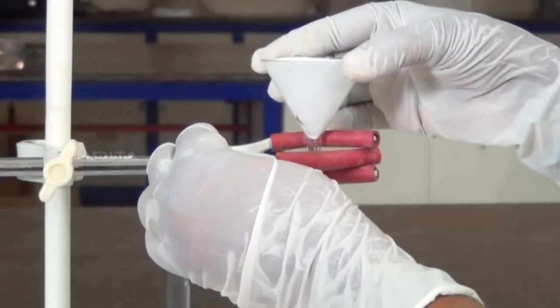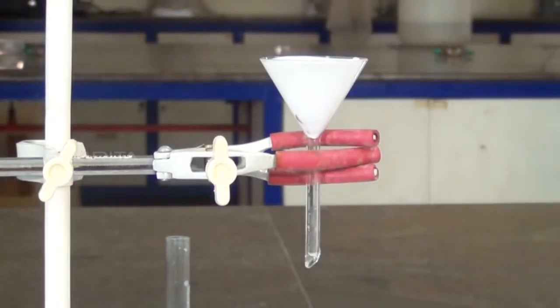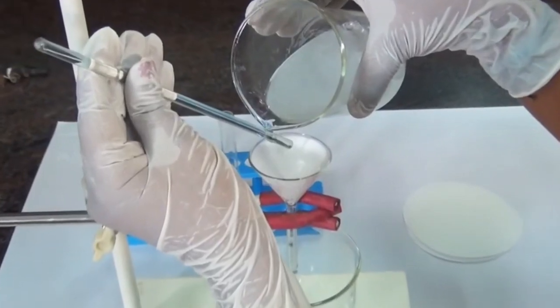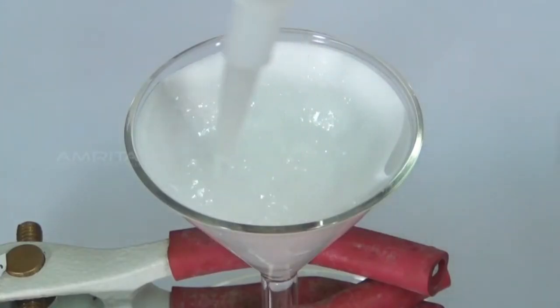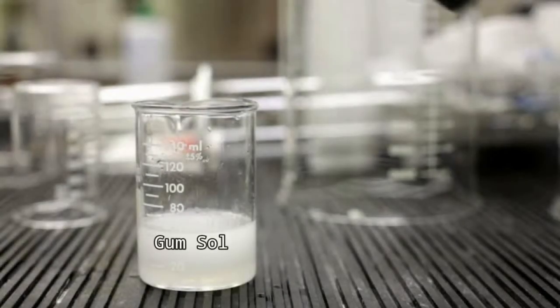With the help of a filter paper and a funnel, filter out the contents. Wait till the mixture cools down. Label the filtrate as gum sol.